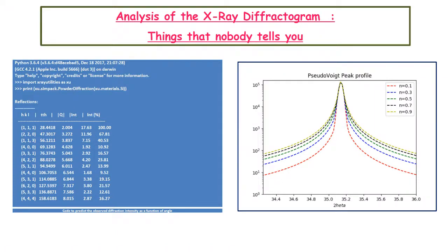But now let me tell you something that we like to talk about, something about the XRD spec analysis that nobody tells you. And again, as I said, these are in no way a substitute for the advanced analysis program. But most of these programs do not allow you to tinker with them. So if a student wants to learn, that's what we believe. We provide the small nuts and bolts in the understanding of the bigger picture, and that's what makes the picture complete.